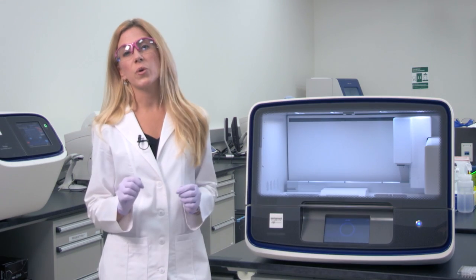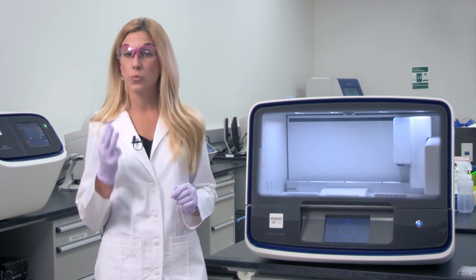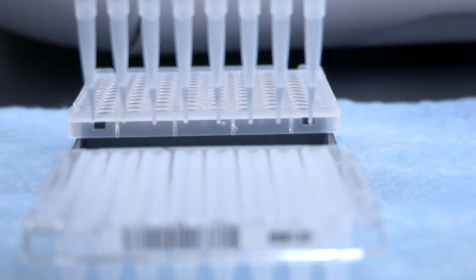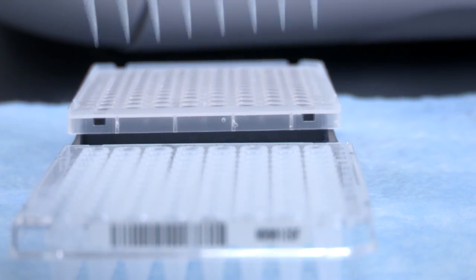So first let's start with Ion AmpliSeq library prep using the Ion Chef system. It's super easy with just three pipetting steps. First, what you're going to want to do is load your eight samples into the PCR plate. The PCR plate already comes with your barcodes dried down, and you can use as little as 10 nanograms of DNA starting material.